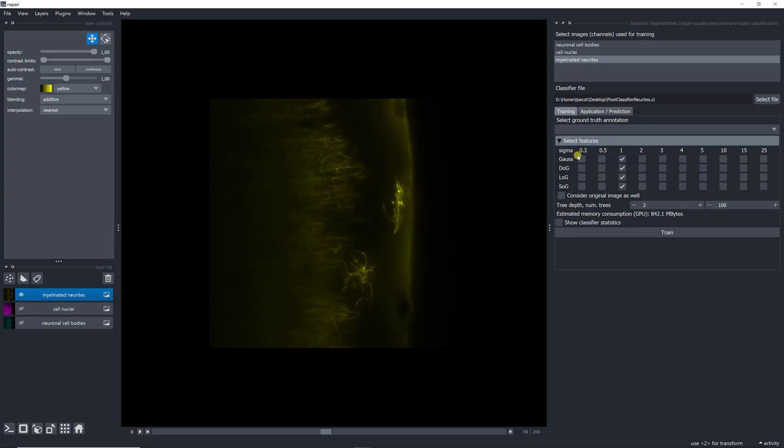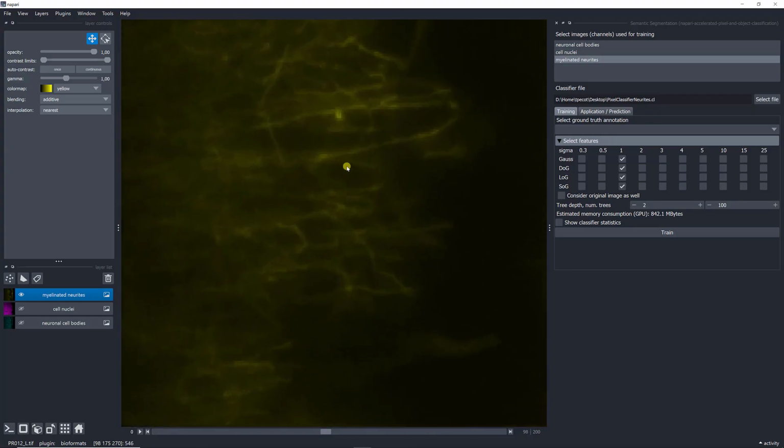When you have structures like this that are very high resolution, how to explain that? You have structures where you really need the most resolution to actually identify these different fibers here. It looks like fibers, neurites. You definitely need high resolution. If you go into low resolution, you're going to blur everything and you won't be able to identify the individual structures here. So it's very important to have something low, so like 1 should be fine.